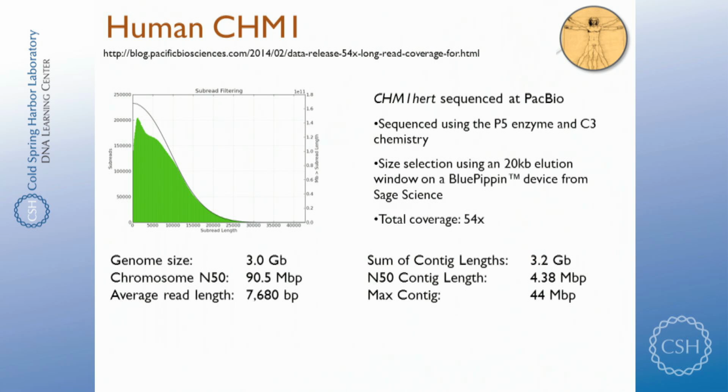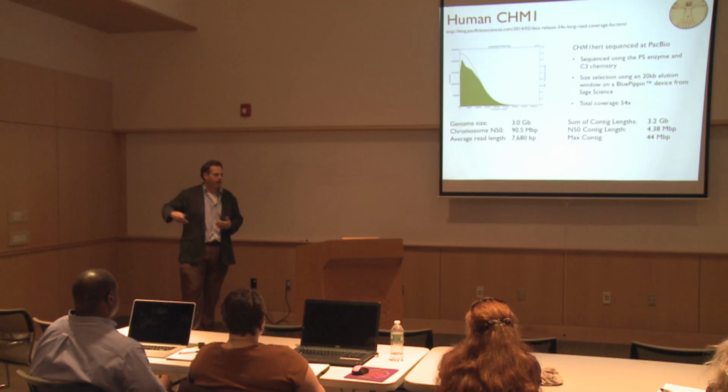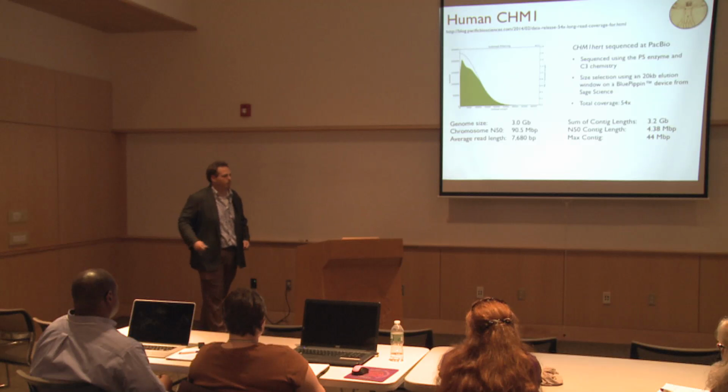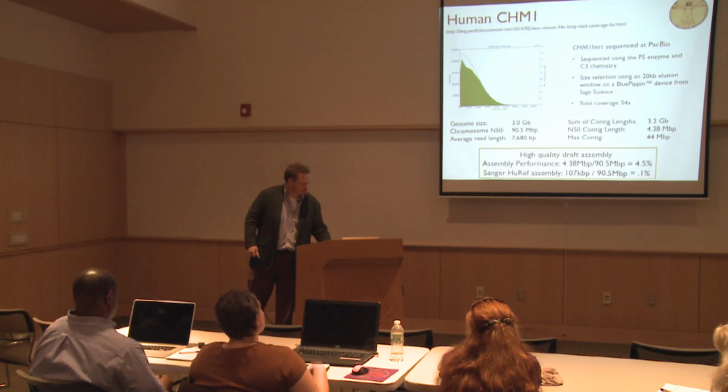Now, because human chromosomes are so much longer, this is not yet individual chromosome arms by any means, but it's showing the path forward. Just recently, PacBio has announced they have in-house some technology that's going to extend the read lengths, improve the throughput, and then suddenly everything, knock on wood, should link together even better and better over time.